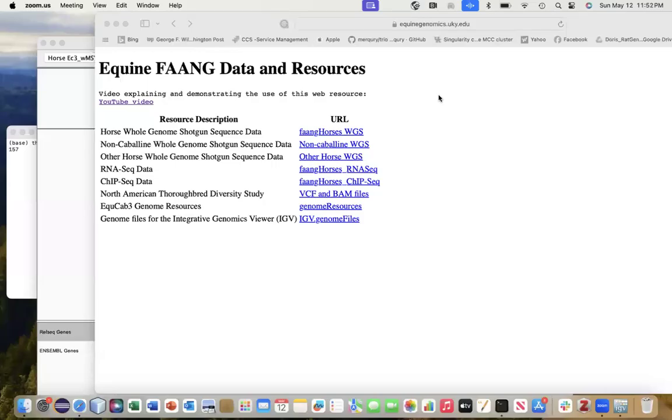Hello, I'm Ted Kopfleisch. I'm going to talk to you today about a large data set that was recently generated for a study of North American thoroughbred diversity. What we've essentially done is we've created BAM files for 185 North American thoroughbreds, and from those we've derived a variant call format file, and they are posted here for your use.